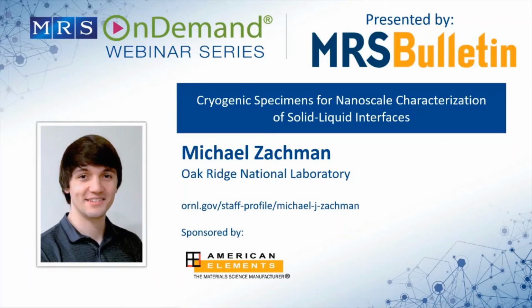There are a number of questions that have come in, and some have obviously some overlap between them, but I think one of the first questions that people want to know is how beam sensitive are battery materials when you're working at cryogenic temperatures?